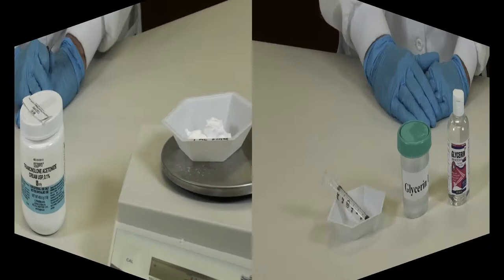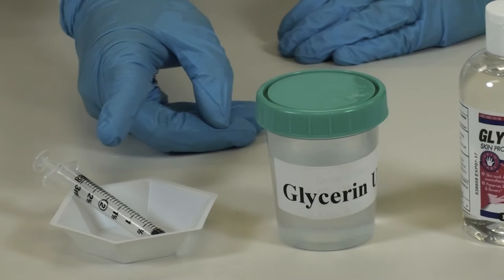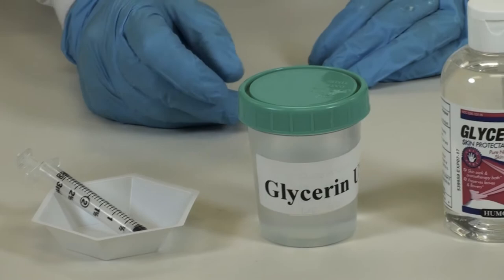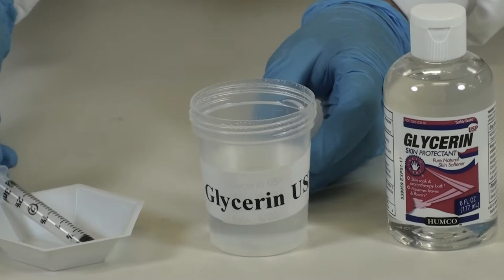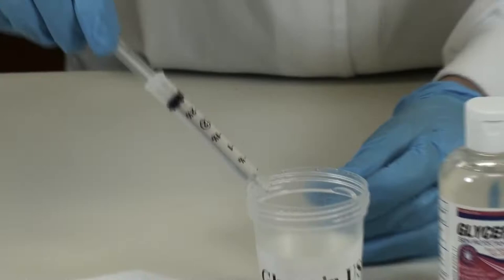Since you do not know how much levigating agent you're going to need the first time you make a cream or ointment, go ahead and draw excess into your syringe. Today we're using a 3 ml syringe, so draw 3 ml of glycerin, getting rid of all the air bubbles so that you can measure the levigating agent accurately. I now have 3 ml of glycerin in my syringe ready to use in my procedure.